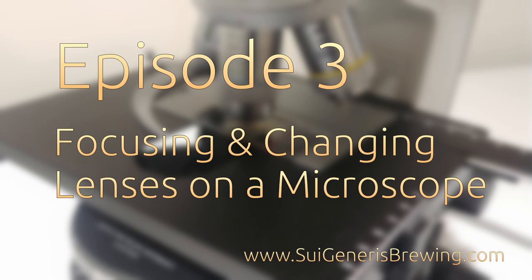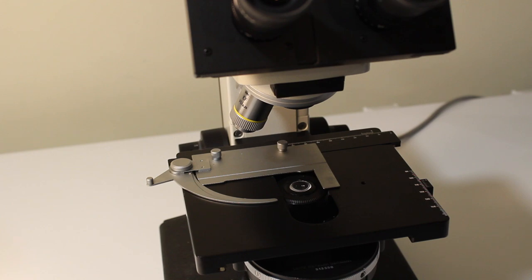Welcome to Episode 3 of Microbrews, my new video series on how to make the best use of a microscope in your home or craft brewery. In this episode, we're going to talk about how to focus on your sample and switch between magnifications.